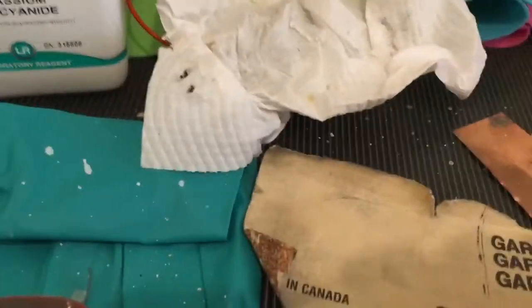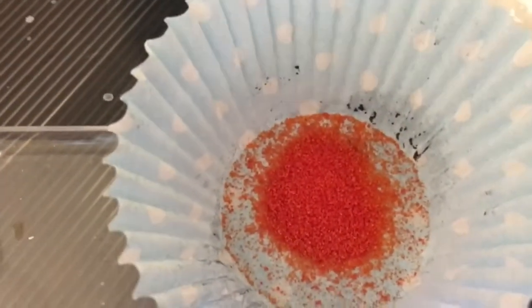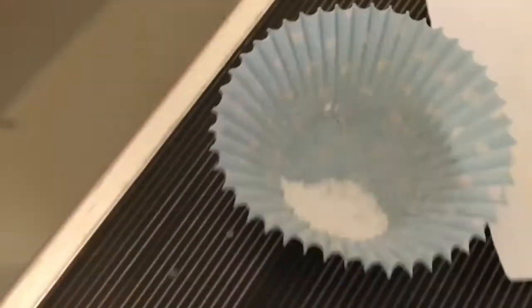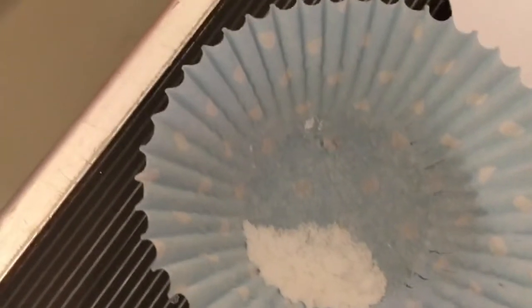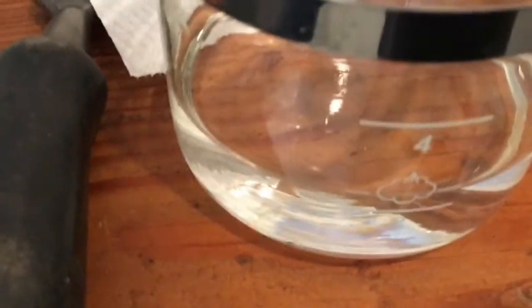It's time again to make some zinc hexacyanoferrate nanoparticles. I have one gram of potassium ferricyanide and one gram of zinc sulfate. I have 100 ml of distilled water for the zinc and this will be the mixing chamber. 100 ml of distilled water here.